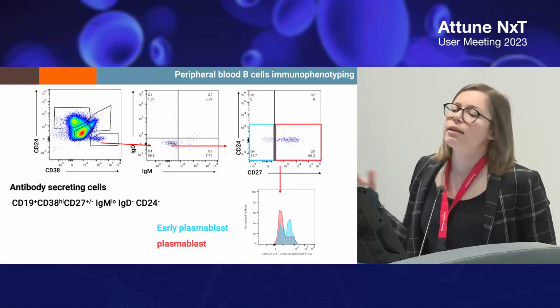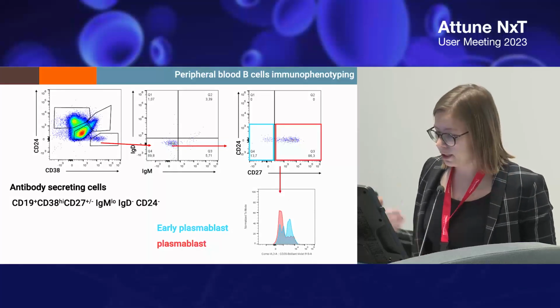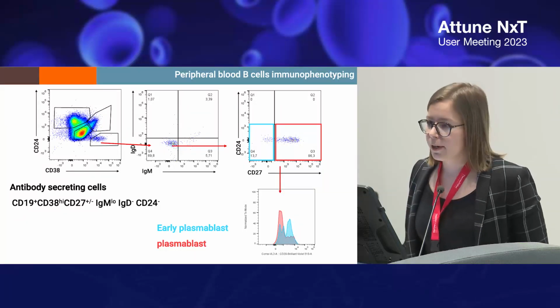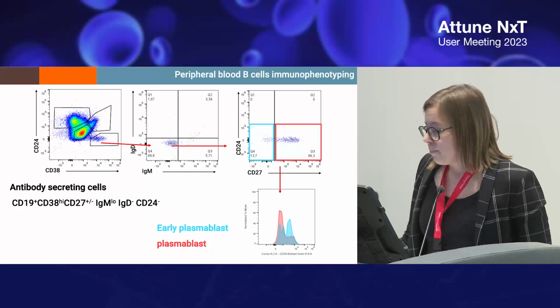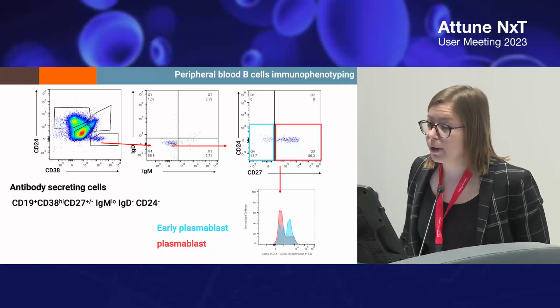Again, we can distinguish the various differentiation steps of a plasmablast by checking CD20 expression this time.